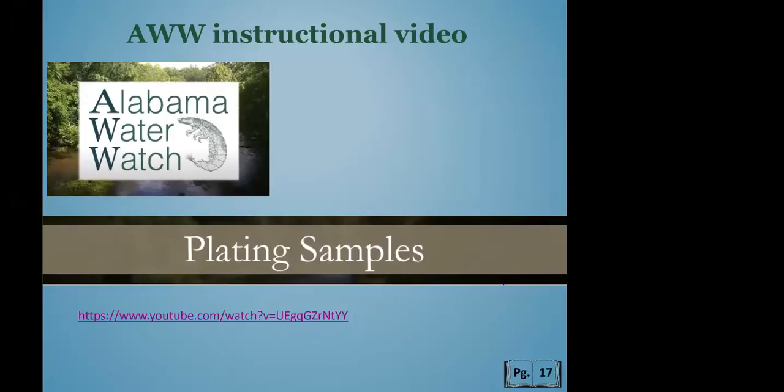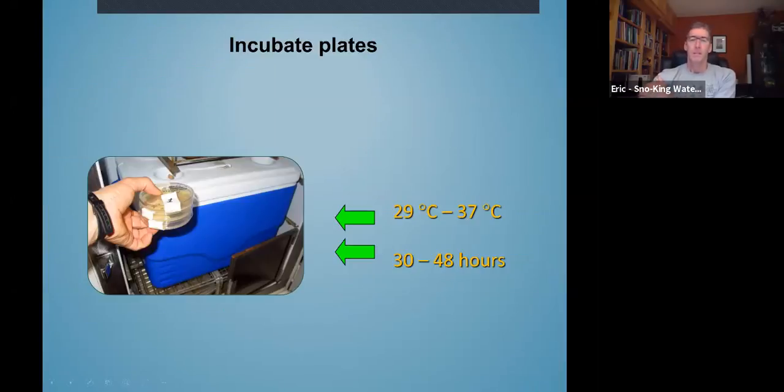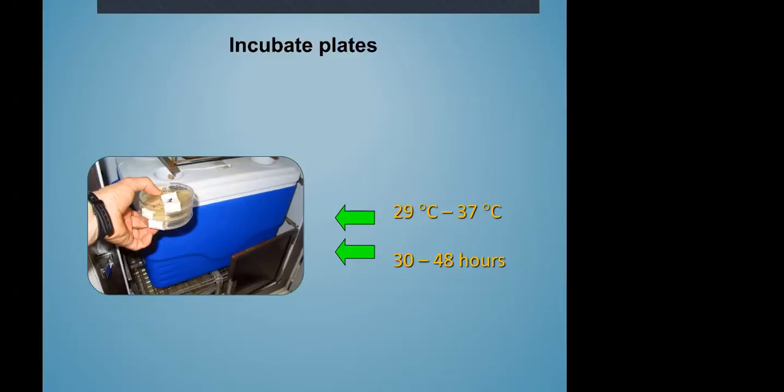But I'm a biologist, so I have different curiosities than other people might have. I've also been known to let whales collect my samples for me. They exhale and blow a bunch of water into the air, and then I'll collect the droplets as they settle down and culture those.